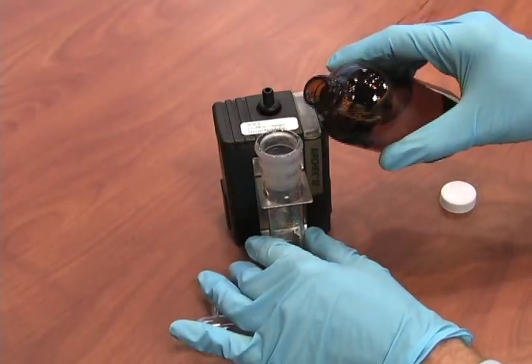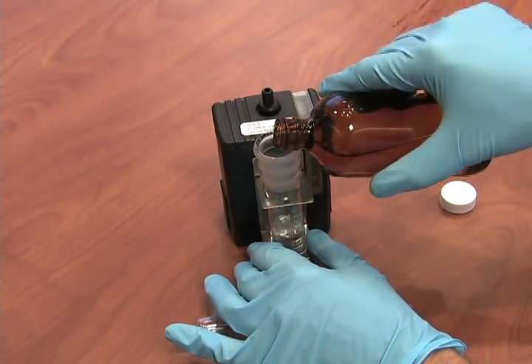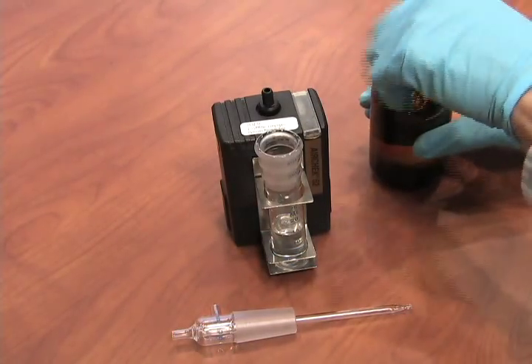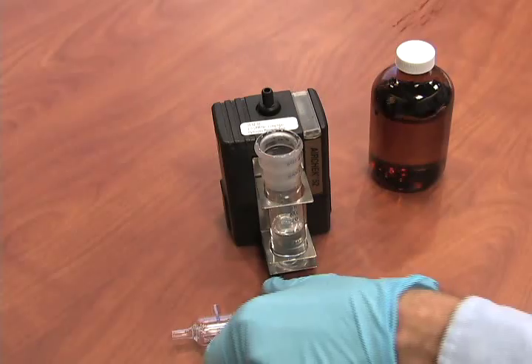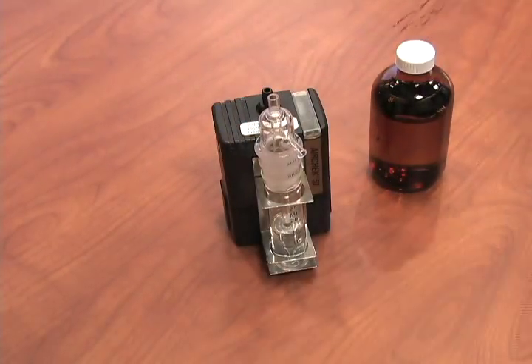Insert the bottom portion of the impinger into the impinger holder with the units of measure visible. Dispense the proper amount of impinger solution according to the method, using the milliliter measurements on the impinger as a guide. Now insert the top portion of the impinger into the bottom portion.